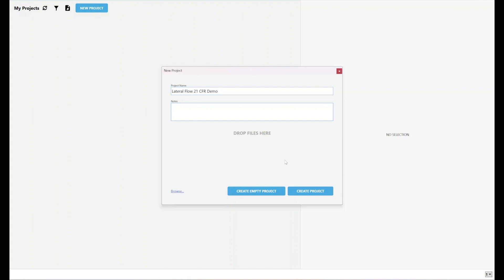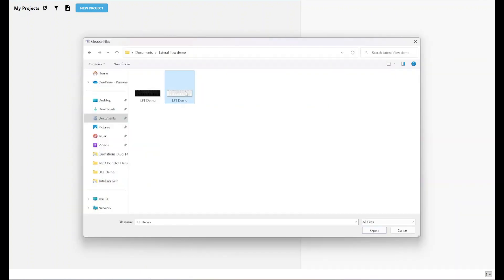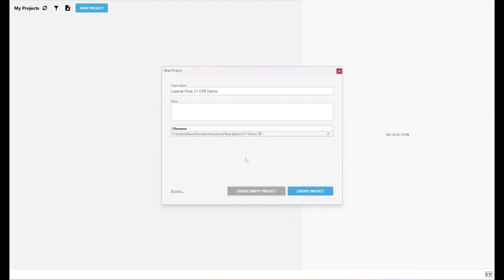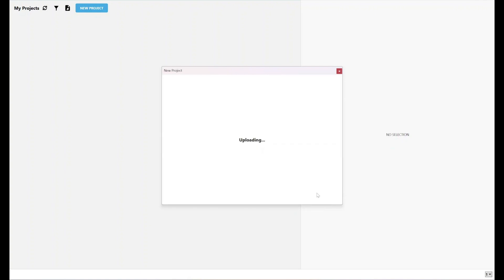And then it says drop files here. I can drop my image files in by left clicking and dragging them in, or I can use browse. There you can see I've just dropped in my lateral flow demo image that I used in my previous video. Now I can create my project.